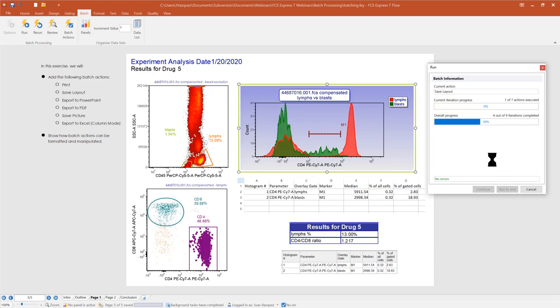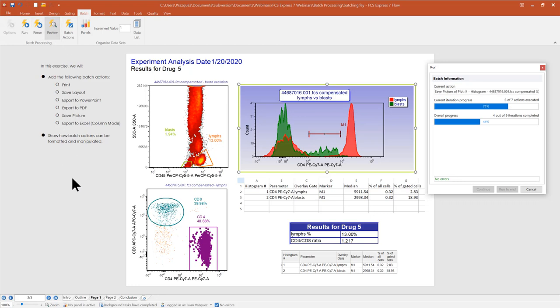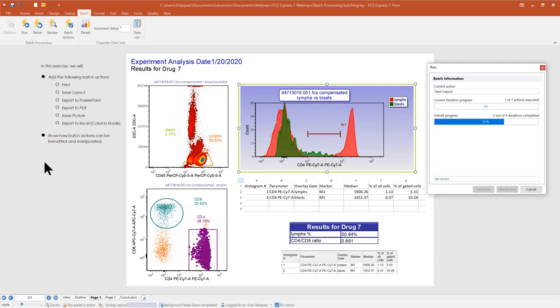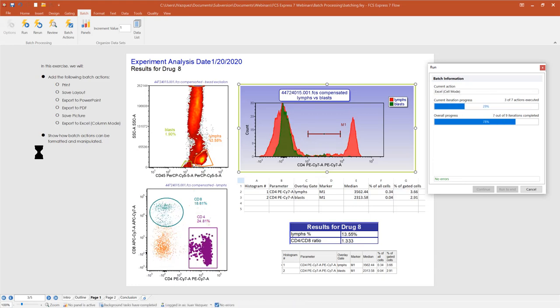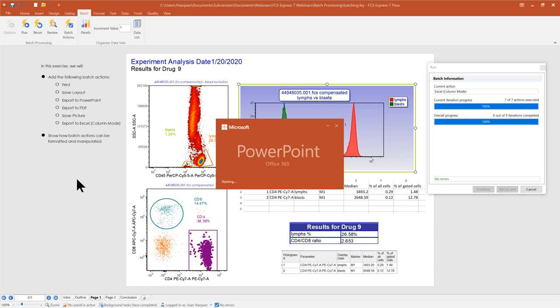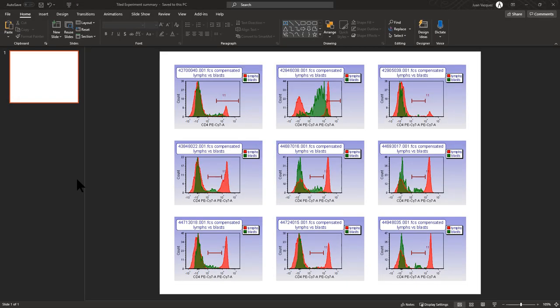There are three run modes: Run, Rerun, and Review. Run is for processing a batch for the first time on a particular data set — you can pause between samples and tweak gates. As FCS Express moves to the next iteration, it remembers the position of all gates, markers, and quads for each iteration analyzed. You can also flag a particular sample during the run to come back to it later.